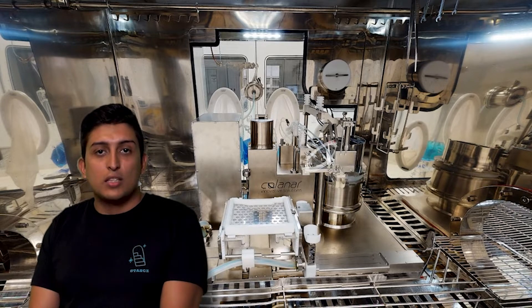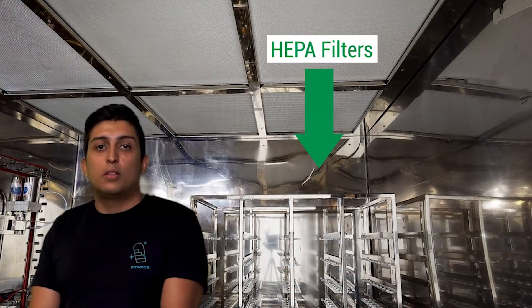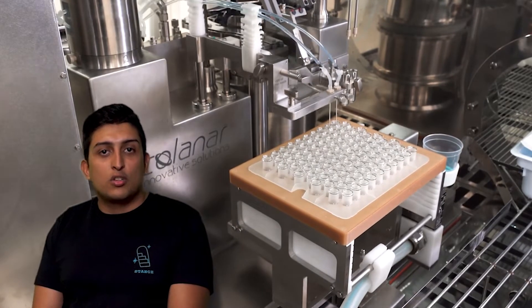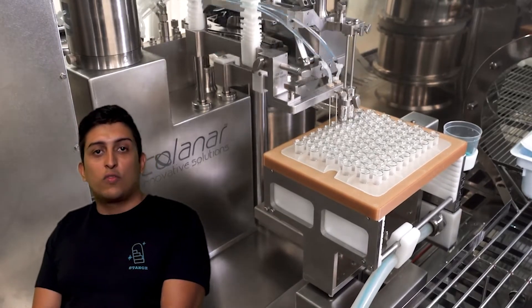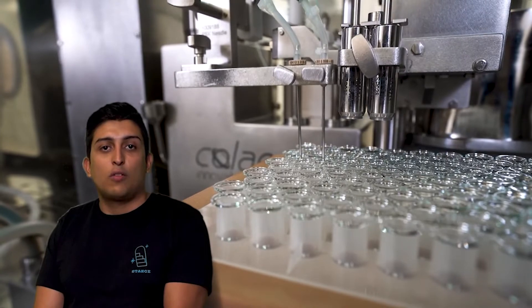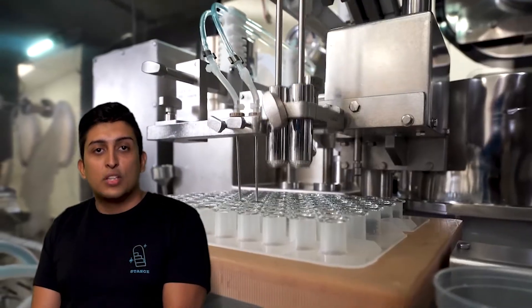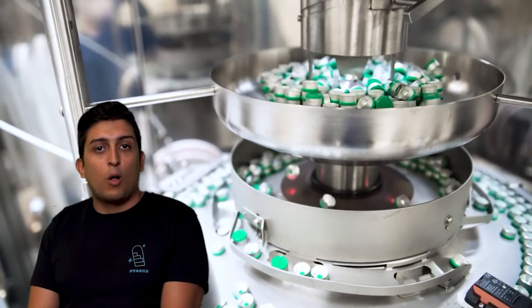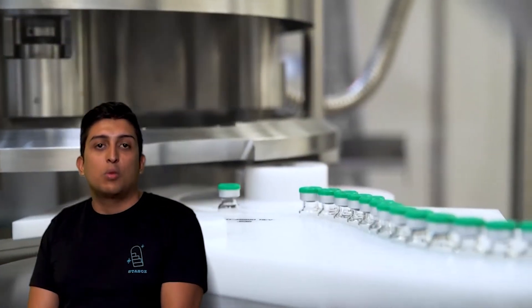Once the filling line is sterilized, the VHP will be removed and replaced by clean air, which is pumped in from HEPA filters that make up the ceiling of the isolator. And that's where the fun can begin. We'll connect the sterilized drug product to the filler inside the isolator, and we'll fill vials, syringes, or cartridges. We can also freeze-dry any medications that are sensitive to extend their shelf life from sometimes as little as a few weeks to several years. BSM is unique from the other companies that manufacture medicines because we use the most advanced technologies to fill all types of containers and drug products on the same filling line, and we use the best isolator machinery to ensure that the medicines we produce are sterile.